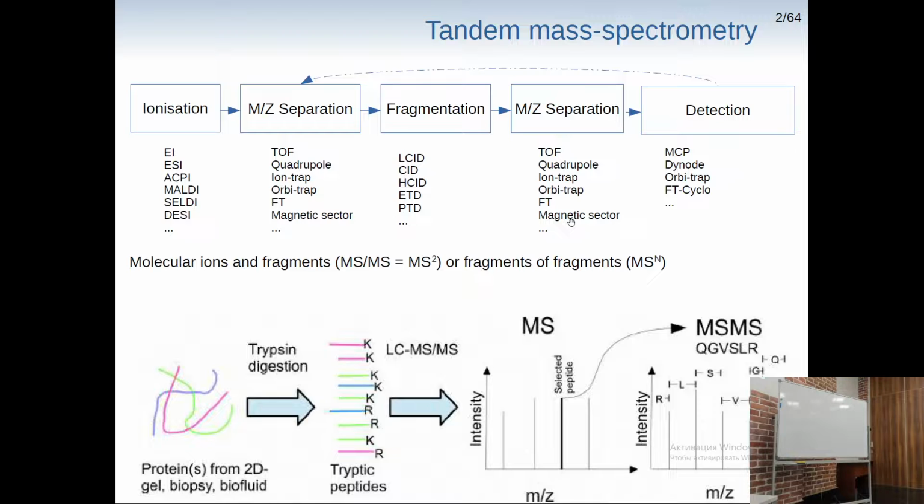Why is it quite important also? Because we've got those tryptic peptides after digestion of our protein or proteins. We know that there are at least some amino acids at some end, because trypsin cuts at predefined positions. But we don't actually know the sequence of those peptides. If you can select just one peptide of this mix and then fragment it, in the ideal case we will be able to get information about its sequence. Of course, in an ideal setup, it's not always possible.